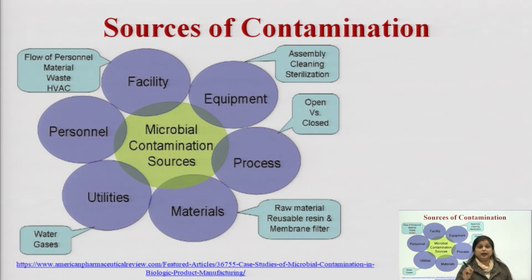The personnel who are working, the students, the lab technicians, even the faculty members, whoever is working there, may be a source of contamination. So, we have to take extra precautions while we are working within the aseptic areas. We need to take care of personal hygiene. The buildings in which we have made the lab or the environment may also be a source of contamination.